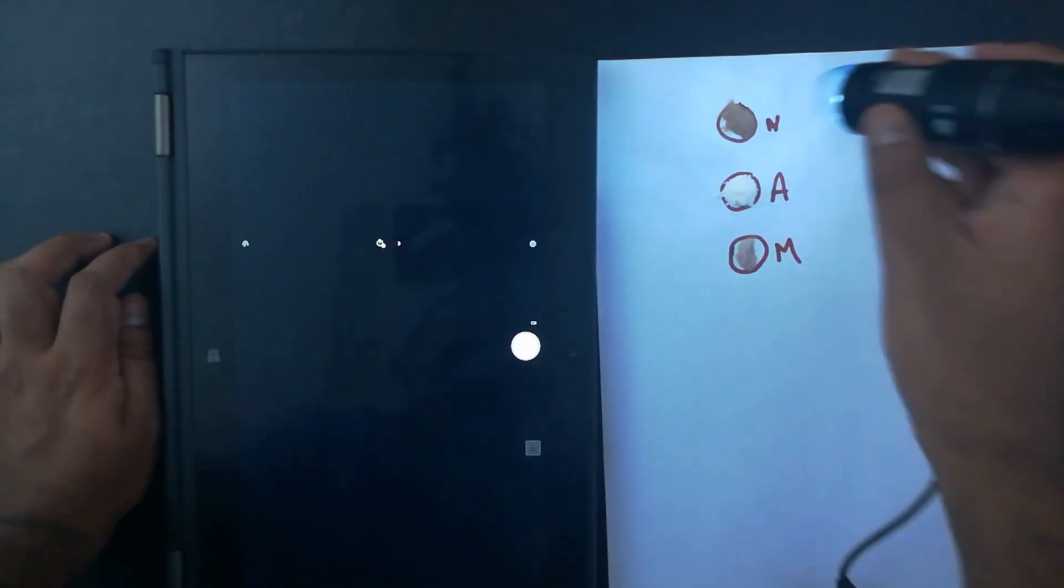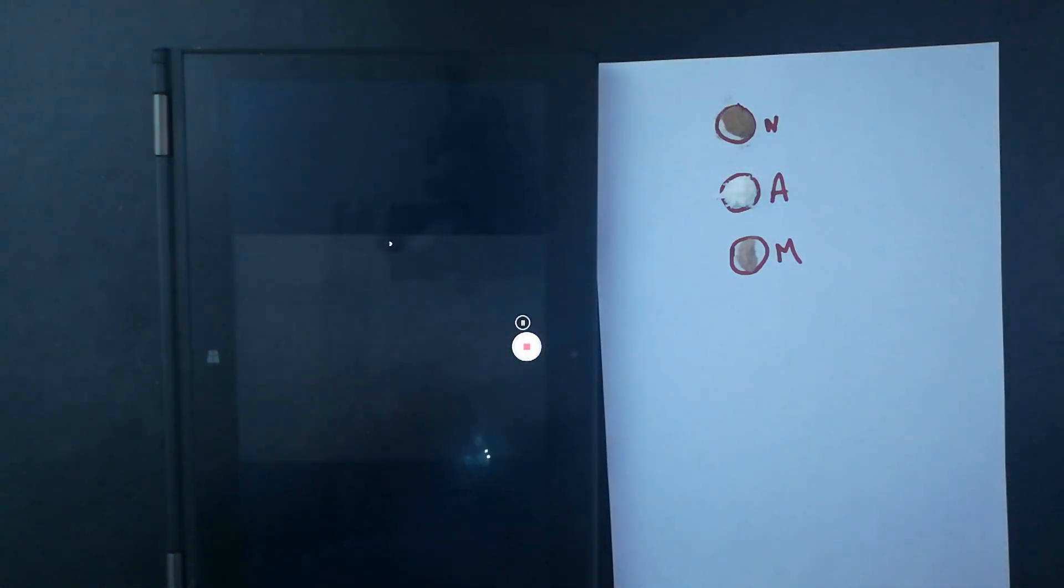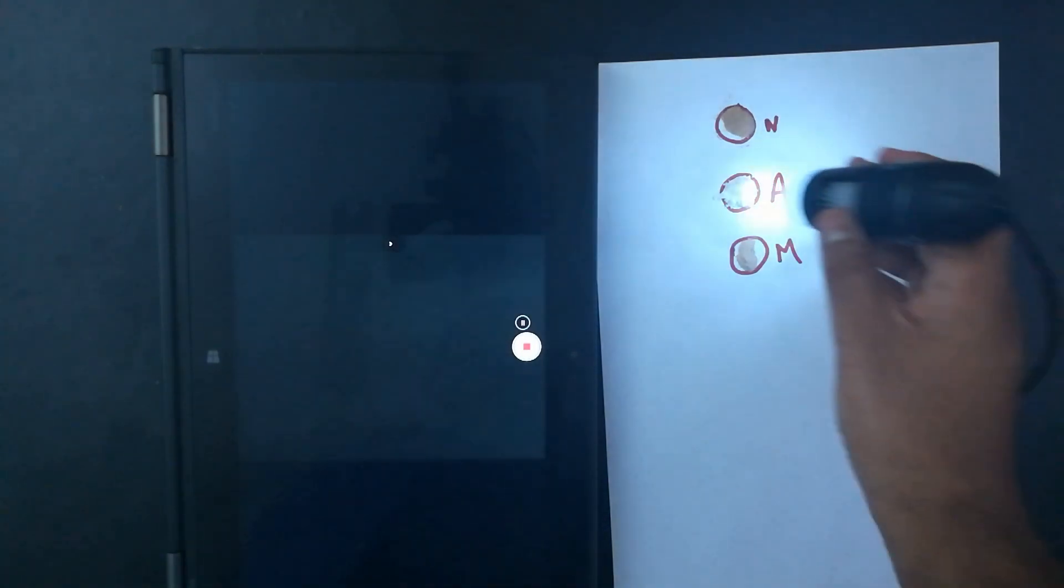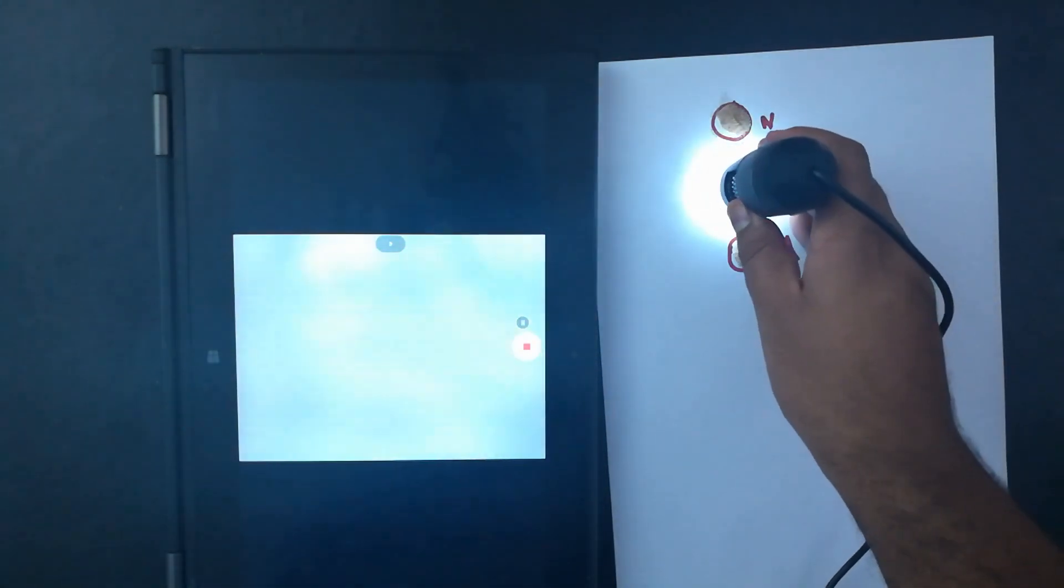So let's start with Nutrimed. Here's how it looks under the microscope. Nutrimed. It's like sand type of, you know, that's how it looks at least. Now we'll move on and we'll kind of brush off the surface.